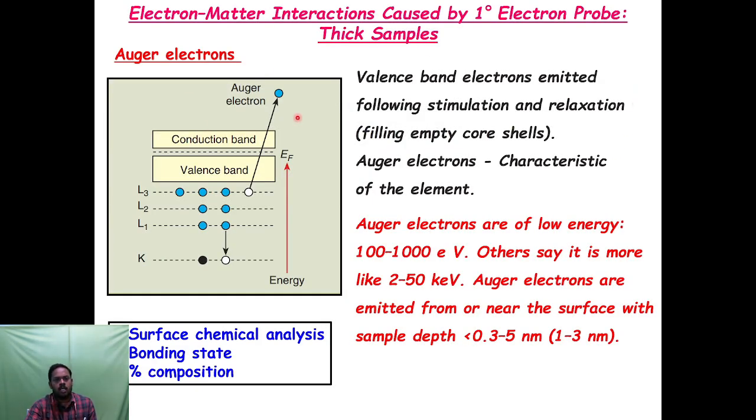And this is another kind of secondary effect that is called the Auger electron. We cannot study the secondary effects step by step. All these effects happen together. When we get the sample, the K shell electron will be ejected. That is called the secondary electron.